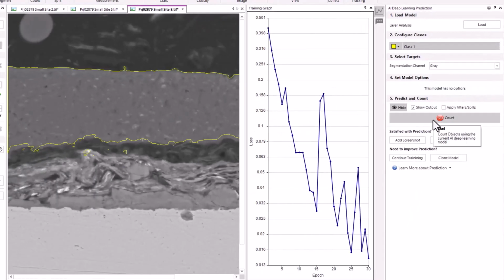In this particular case, the small areas that are selected can be filtered out when we set up the final workflow. However, please note that the layer has been correctly found. Additional training may get rid of those small errors.